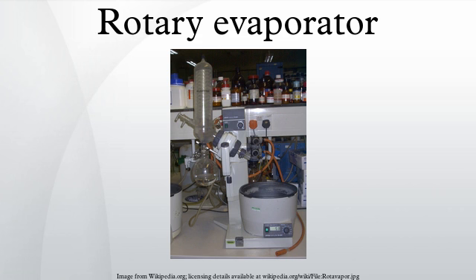Solvent remaining after rotary evaporation can be removed by exposing the sample to even deeper vacuum, on a more tightly sealed vacuum system, at ambient or higher temperature. A key disadvantage in rotary evaporation, besides its single-sample nature, is the potential of some sample types to bump, for example ethanol and water, which can result in loss of a portion of the material intended to be retained. Even professionals experience periodic mishaps during evaporation, especially bumping, though experienced users become aware of the propensity of some mixtures to bump or foam, and apply precautions that help to avoid most such events.